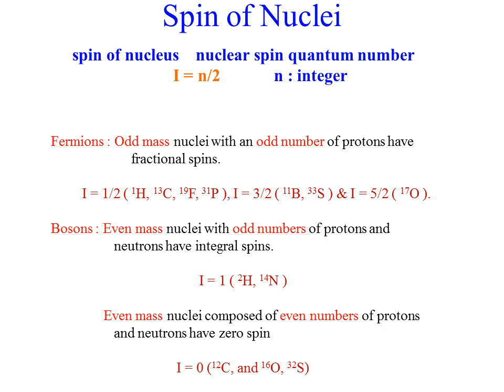Such atoms have a fractional spin. Examples: proton, carbon 13, fluorine 19. Another type has I equal to 3 divided by 2, such as boron, sulfur, and so on.